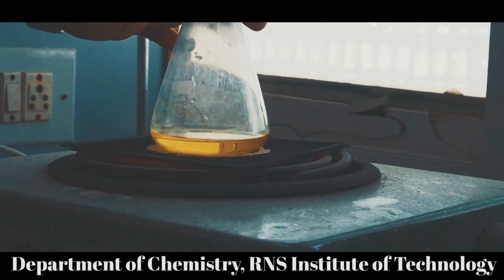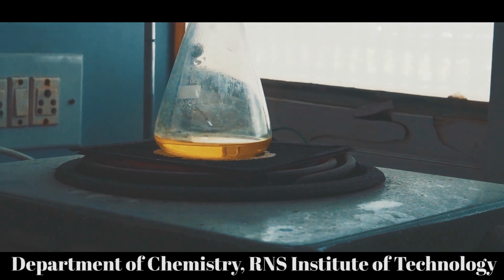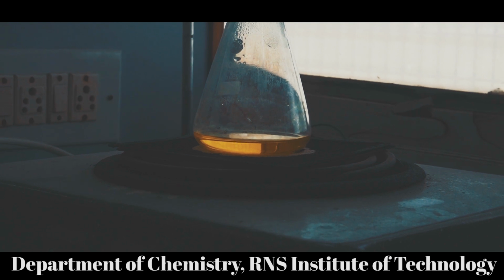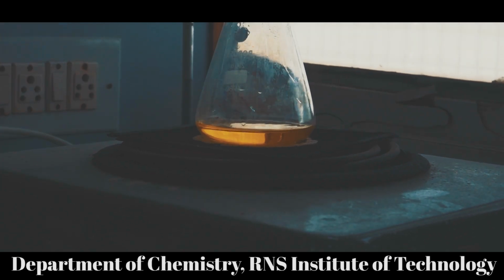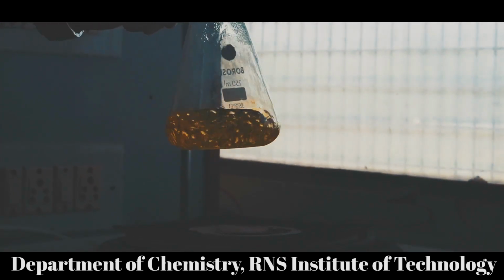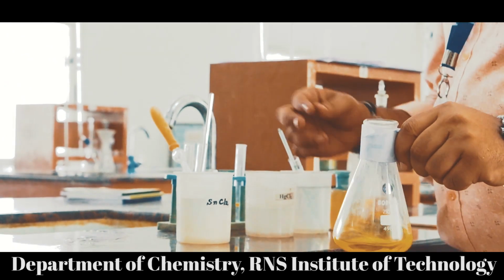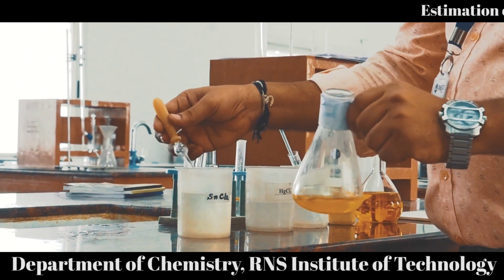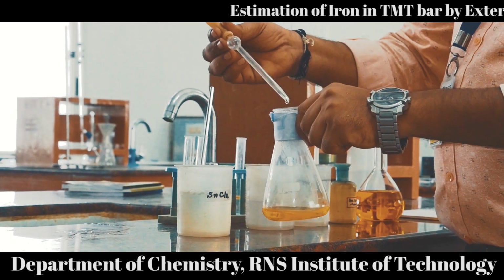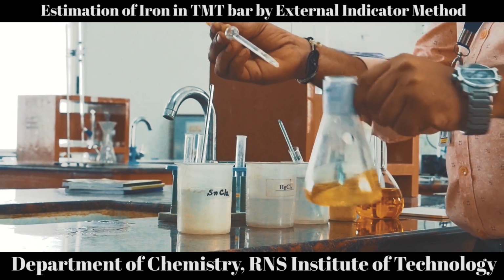So now it has almost heated, so we need to wait until bubbles start to come. So this is sufficient, so you can take the paper support like this and you can remove this solution from this electric stove. So after heating this solution near the boiling, when the bubbles started to come, you have to remove and come back to this table, and you need to add stannous chloride dropwise until the color of this solution becomes colorless, right? So you have to add the stannous chloride in hot condition only.